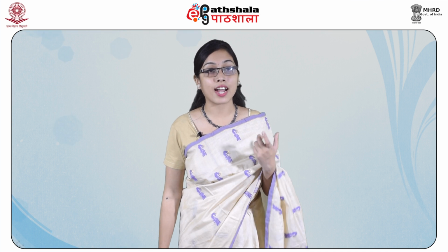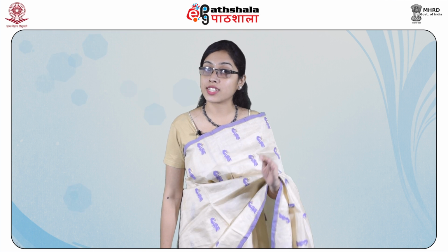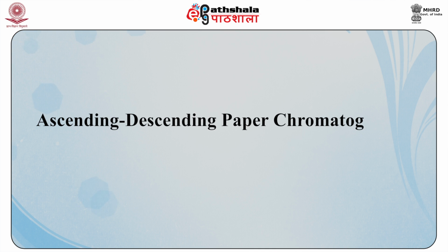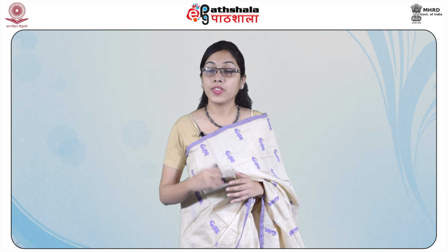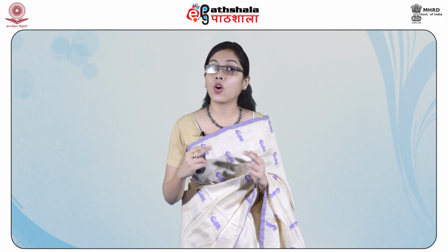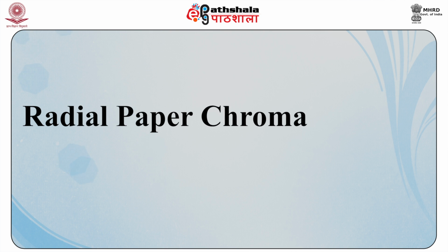The mobile phase is kept in a trough located at the top of the chromatographic chamber and it is allowed to descend over the chromatographic paper. Next is ascending descending paper chromatography. It is the hybrid of both the ascending paper chromatography as well as the descending paper chromatography. The upper portion of the ascending chromatography sheet is folded on a rod while allowing the descent of paper after crossing the rod.